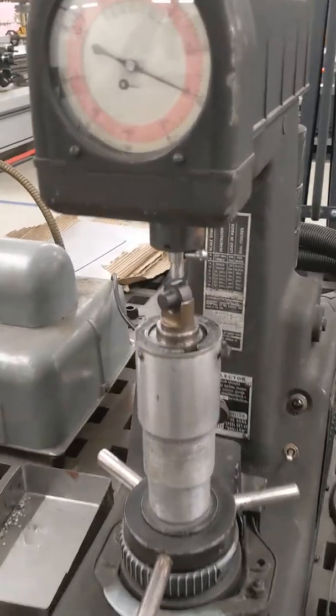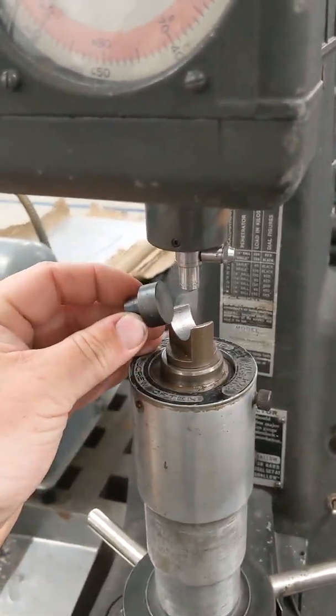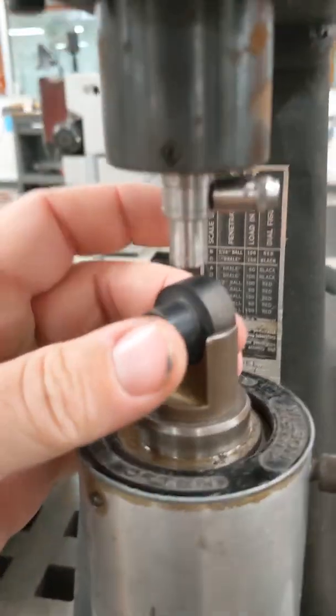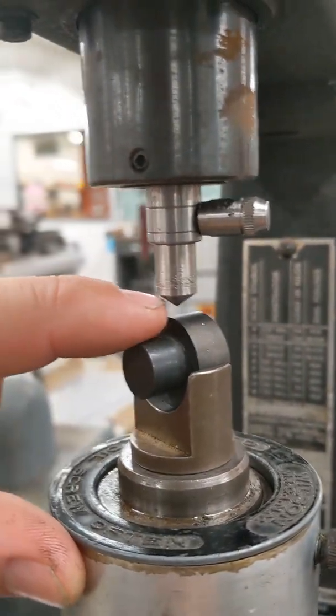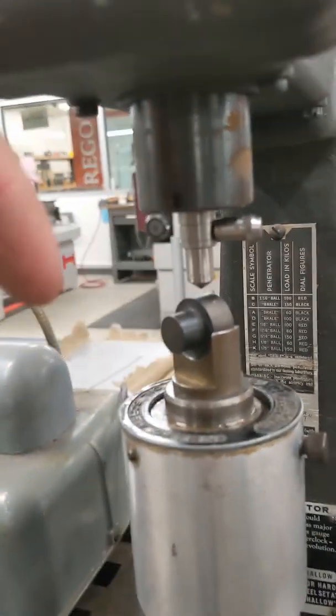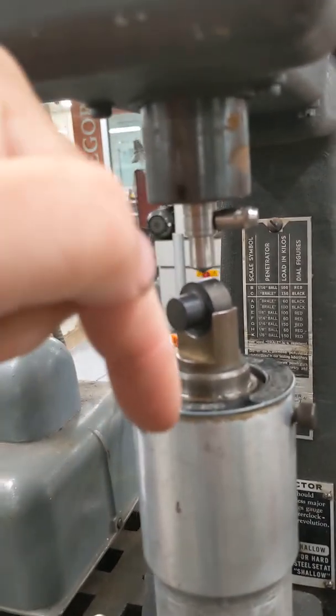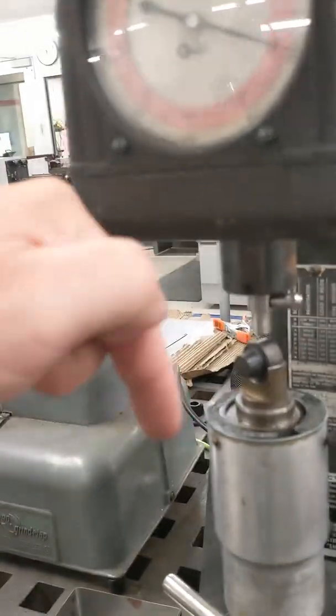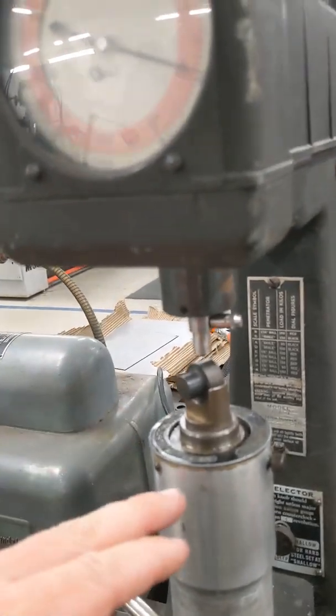The way that this tester works is that a test sample, this example is the hard face for the hammer, is placed in the tester. The sample is pushed up into the point of this diamond-tipped indenter, and the machine applies a load to the indenter and pushes into the material. When the load is removed, it measures how much the material springs back, which is what determines the hardness.